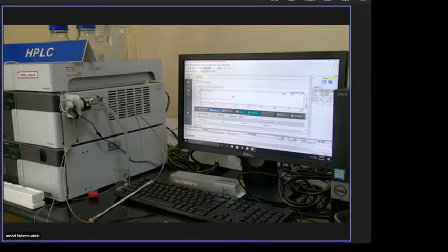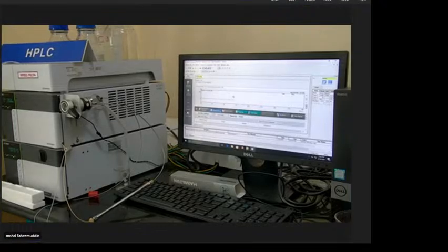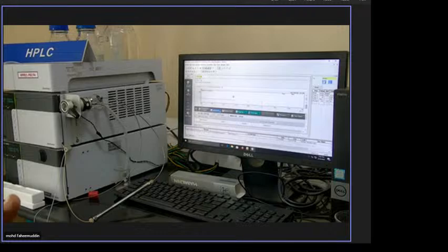So what we are conducting is a program where we are selecting 10 students and going to conduct a certification program on HPLC method development. Every day, the complete afternoon session, you will be handling HPLC for 10 continuous days. This is called the certification program.